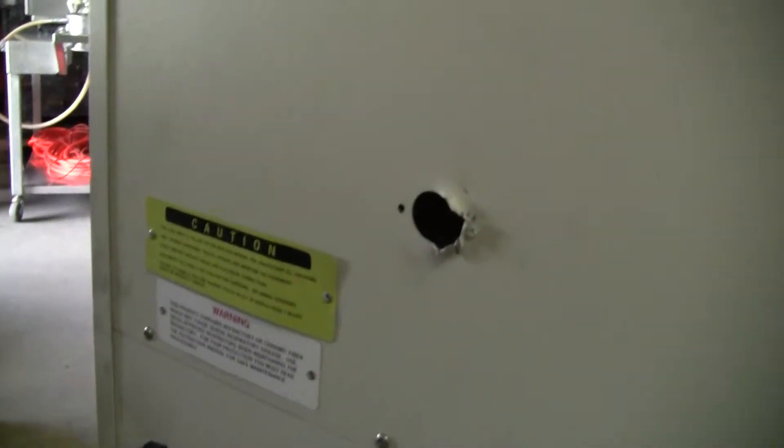It has been used. You can see a hole in the rear of the unit — somebody was playing with something.